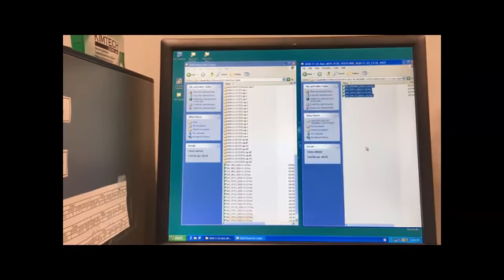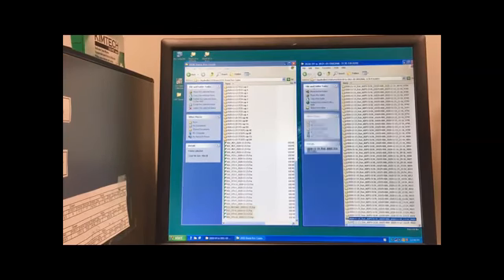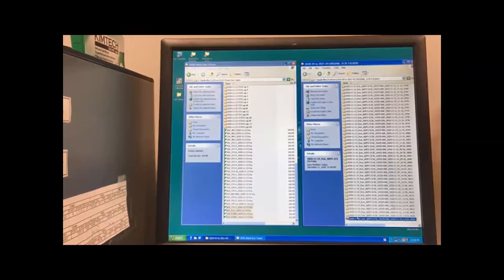All right, good. Control A, Control C. There we go. All right, and then one more. I don't know why I'm making you guys watch all of this, but it's important. Control A, Control C, Control V. Okay, and it doesn't take that long.